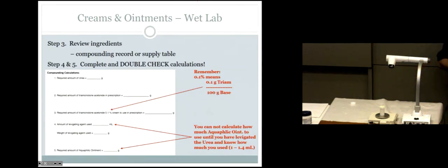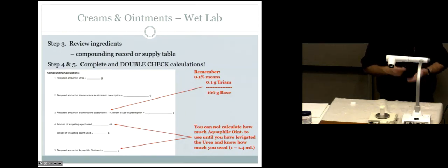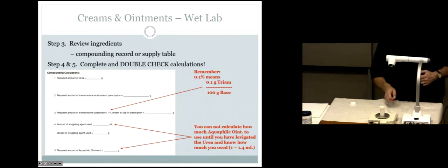Start with 1.5 mils. Don't just add 1.5 mils, because 1.5 mils for this formulation I know to be too much. It'll make too runny a final triturated product. Okay. Start, though, with 1 mil. Instead of taking forever with this, start with your 1.5 mils in your syringe. Go over on top of your drug, add 1 mil, and levigate it. Okay? And then look at it.